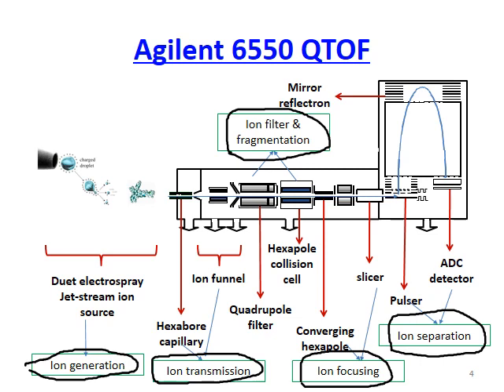The ion source, because it is located at the first part of the instrument, is prone to contamination. Contamination in the ion source would affect both sensitivity and accuracy. So most of the daily maintenance tasks are related to cleaning up the ion source.